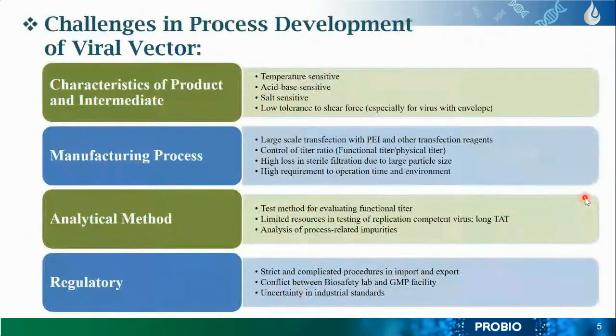All right, I would like to talk about a few challenges in the process development of a viral vector.